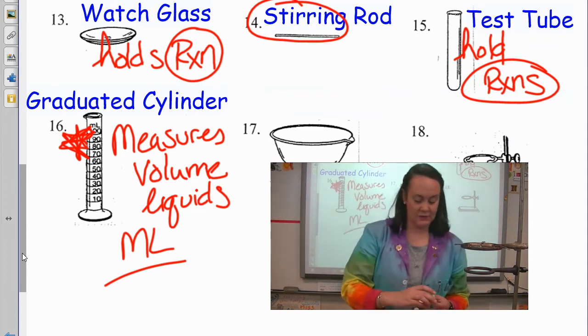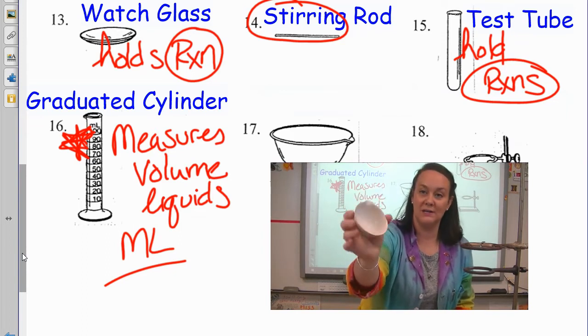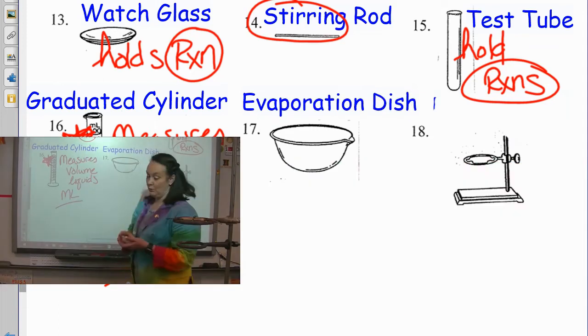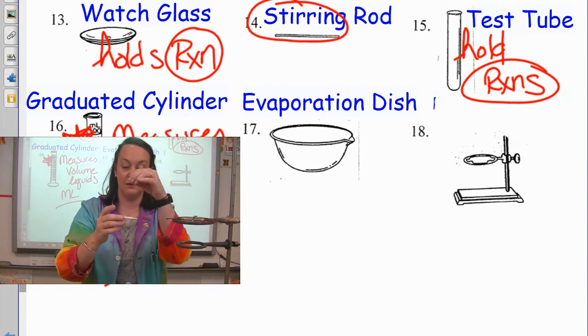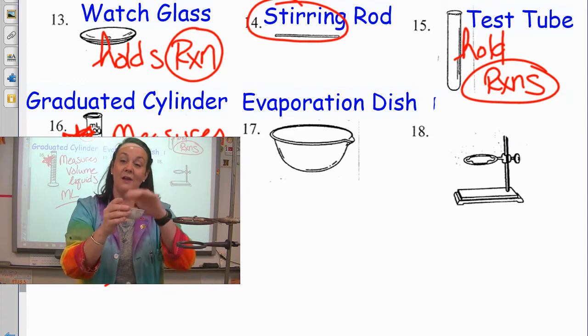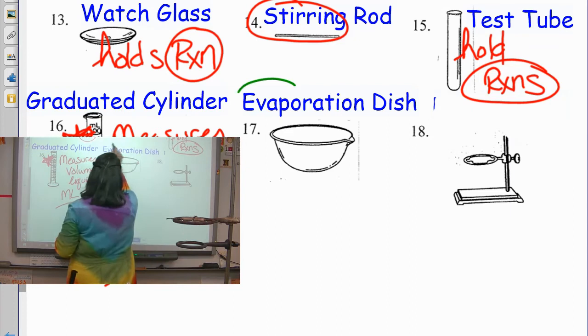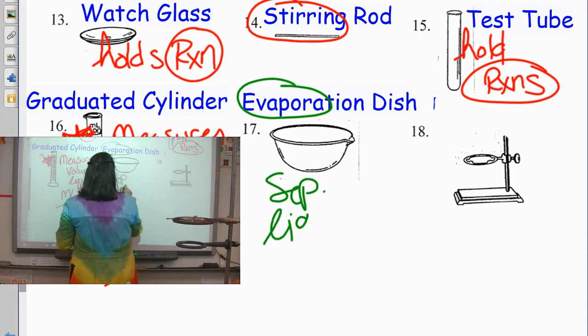Number 17. Probably wouldn't know what this is. We only use it a couple times. This is called an evaporating dish. An evaporating dish. You can probably tell what it does based on its name. If you have a solid, like if we have a hydrate or anything like that, you want to put the solid in there. Put it over the Bunsen burner and then remove any liquid from a solid. So, it evaporates any liquids away. So, you could say separates liquids from solids.